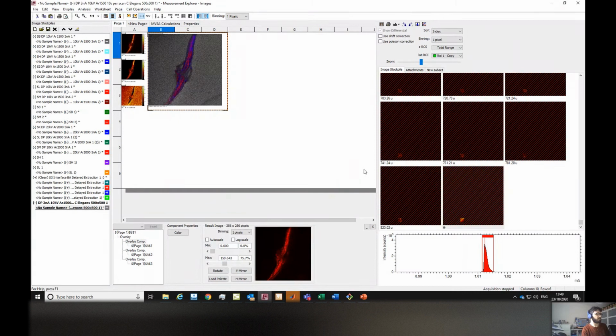So I don't have the version here where we can start measurements, but basically when you go to start measurement, you have the 2D on the left panel, then 2D large area, and the third one is 3D. In the 3D, you can set both the etching parameters and the imaging parameters.